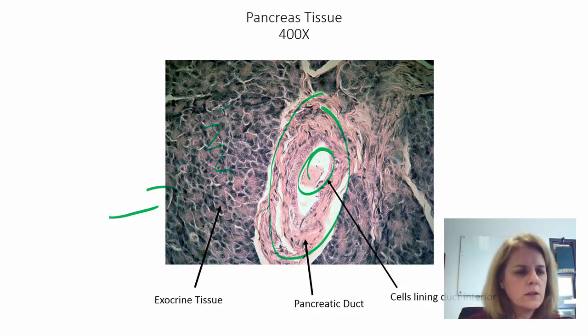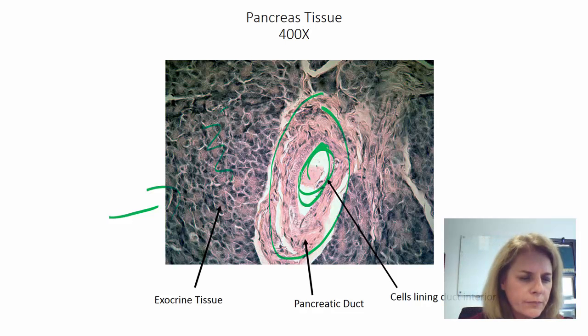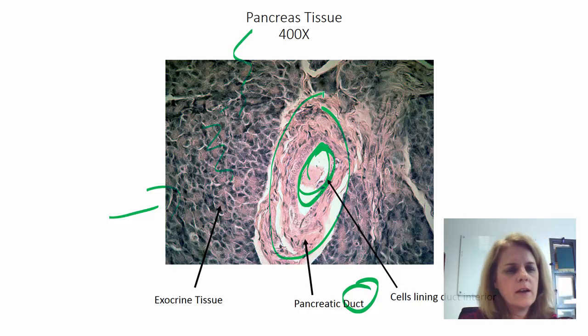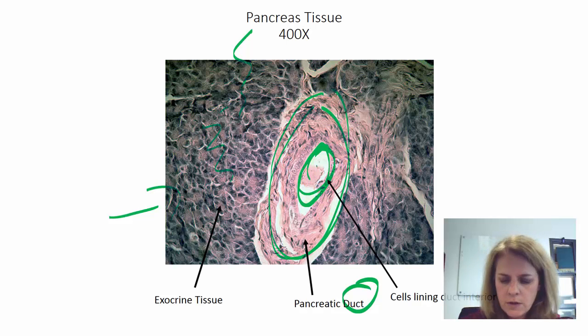All right, so look for a lumen. It looks kind of like a Hassall's corpuscle, I get it, but if you see a lumen, then that tells you it's a duct. It means it's a tube. So look for a lumen, and that's your landmark. You'll see glandular tissue with some kind of pink structure that looks like a vessel. Look for a lumen, and that tells you it's a pancreatic duct, so you're in the exocrine part of the pancreas.